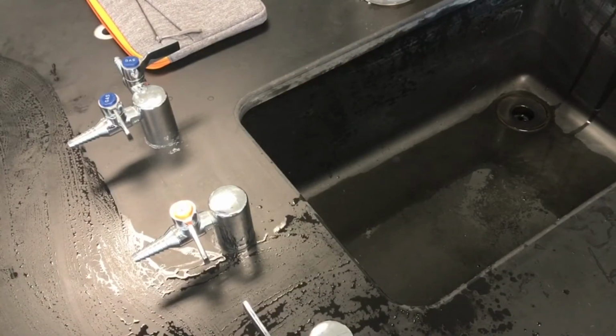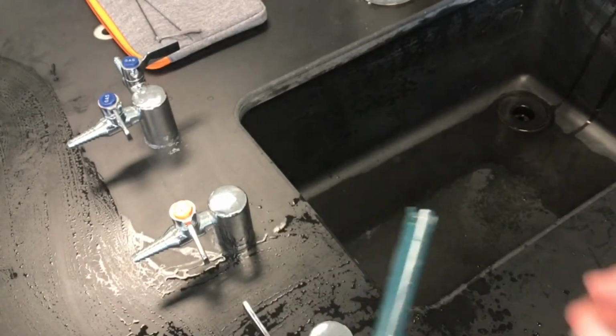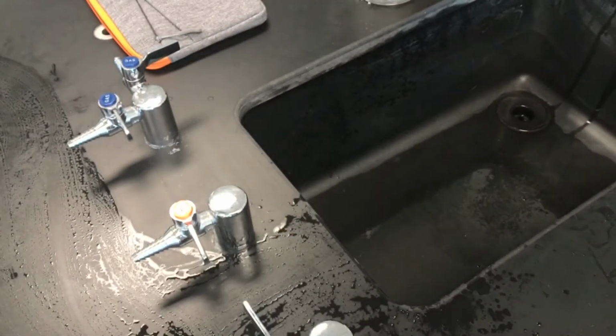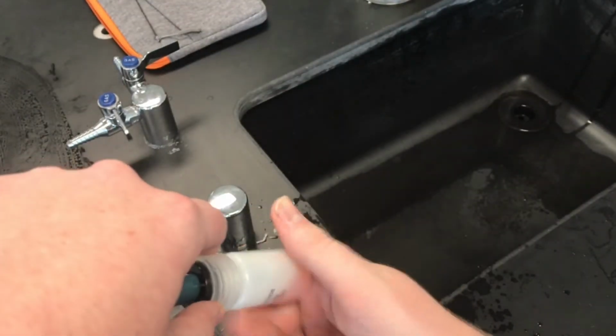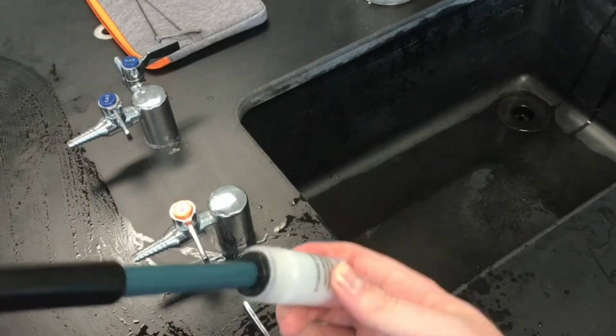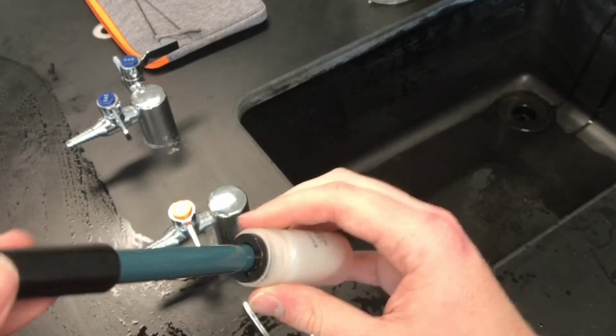Once we have our pH probe cleaned off here, and it's really important, make sure to spray this off with deionized water. I'll place the cap back on. And then I'm going to screw it back onto the storage solution here. So, cap should be on nice and tight. You don't want that to come out.